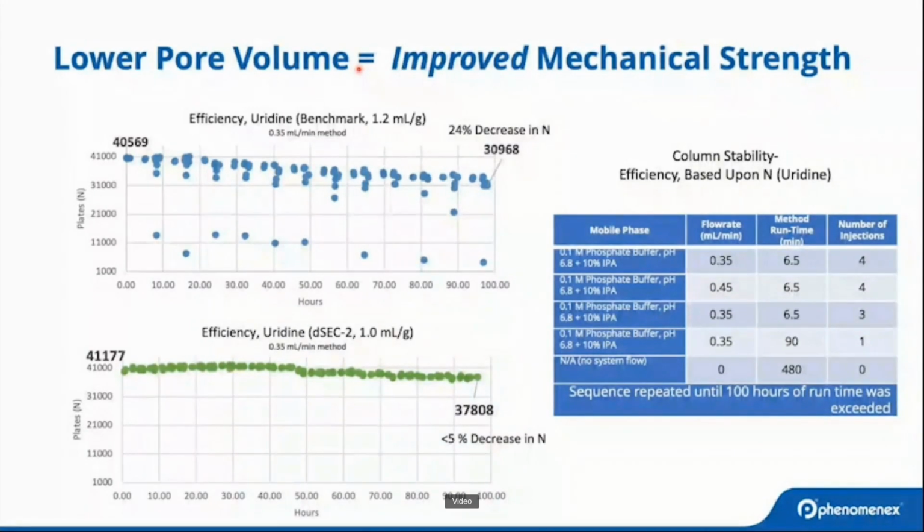Our particular criteria for a stable packed bed is a loss of no more than 25% drop in efficiency. That said, the constant bed stress did result in some erratic behaviour, and we can see this with some plates dropping significantly and then rebounding close to baseline.